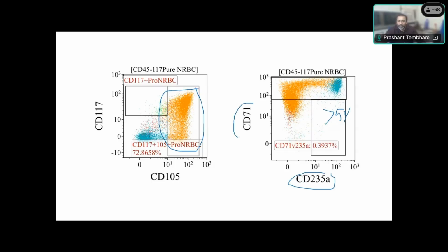So loss of CD71 in more than 5% of terminal erythroid cells, that is CD235a positive erythroid cells, is also considered aberrancy. Okay, dyspoiesis. So here it was not there, but the abnormality in this case was the increase in the pronormoblasts. So in this case, we have given the marrow diagnosis of MDS with low blasts, and we have advised 5q deletion.